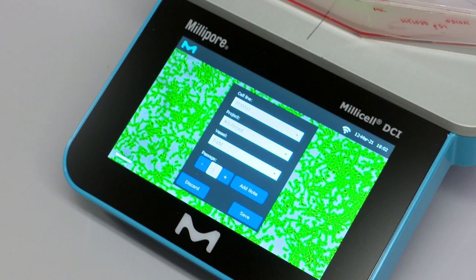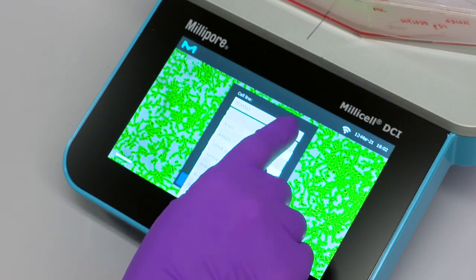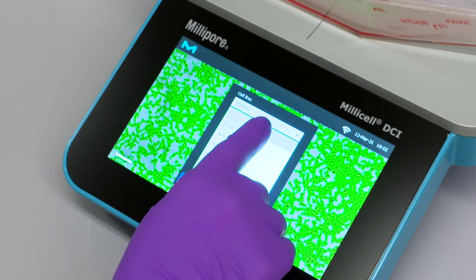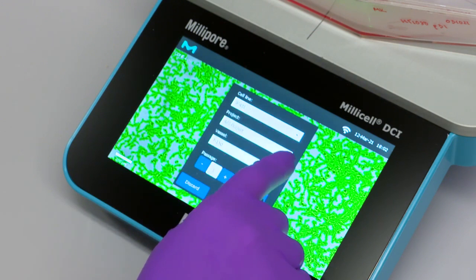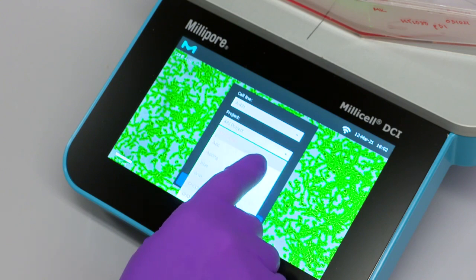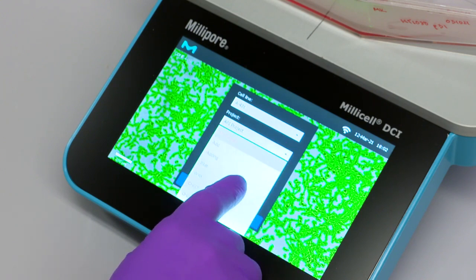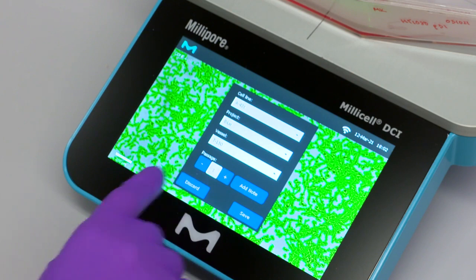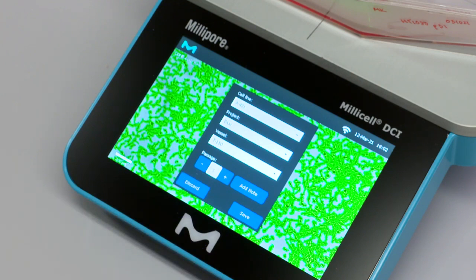The series can be saved by clicking save series. You can input the cell line, project, and vessel either manually or from the drop-down menu. There is also the option to include passage number.